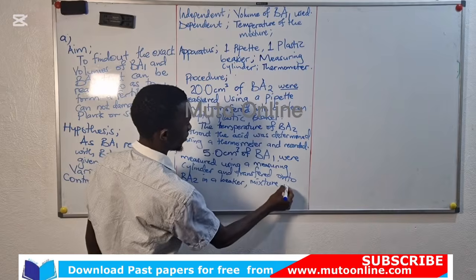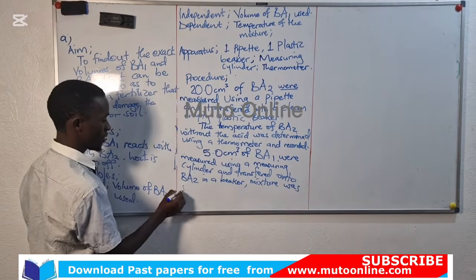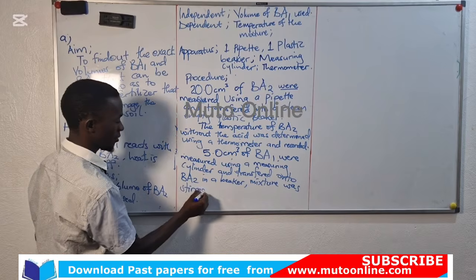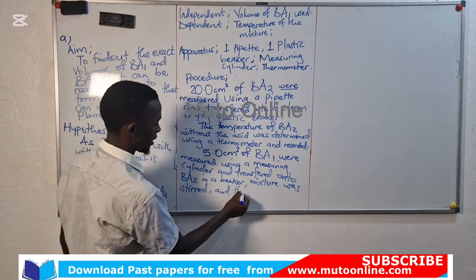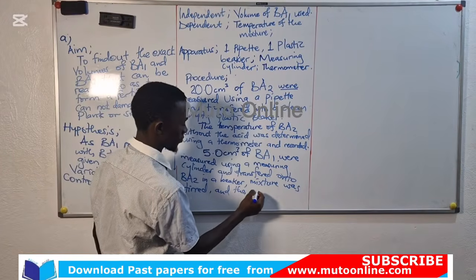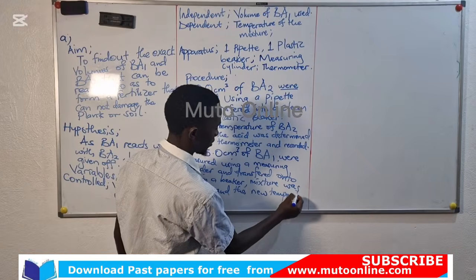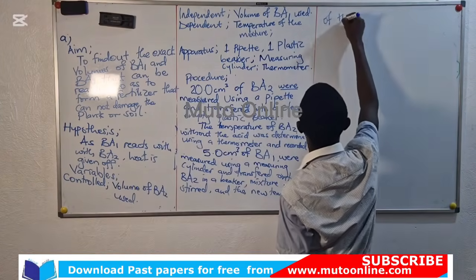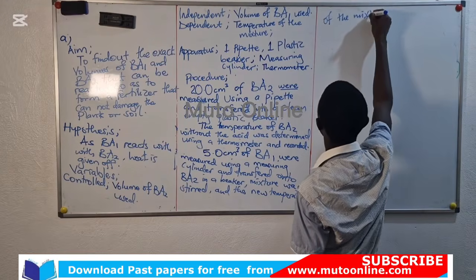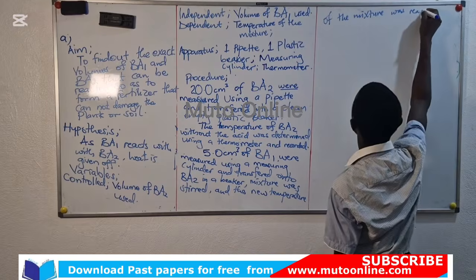the mixture was stirred and the new temperature of the mixture was read.